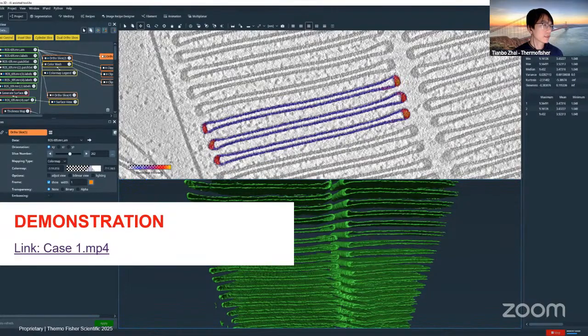We will be placing small squares of different sizes across the 3D space, and then try to annotate where the structure should be and what it looks like. And once we assign those individual structures, we will then have the machine generate a model in turn for the prediction part. Again, as mentioned, the prediction part is an educated guess using the deep learning model.